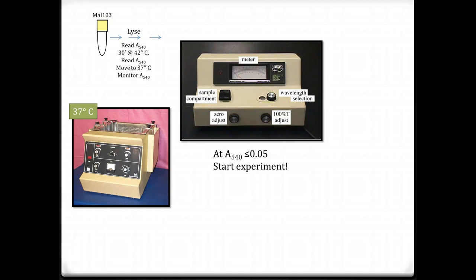It may take an entire half an hour. It may take a little bit more. If something unusual happens and it stops going down, if it starts going up, you should talk to your TA. But as soon as it hits 0.05, or if it goes below 0.05, go ahead and continue the experiment.